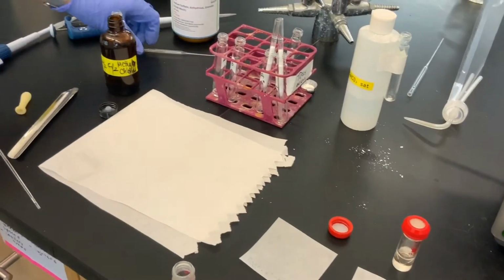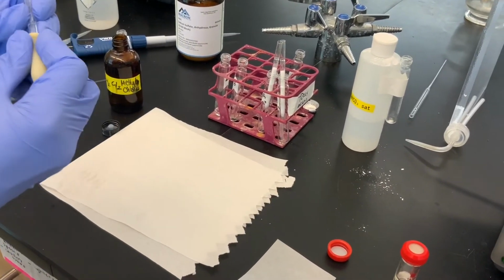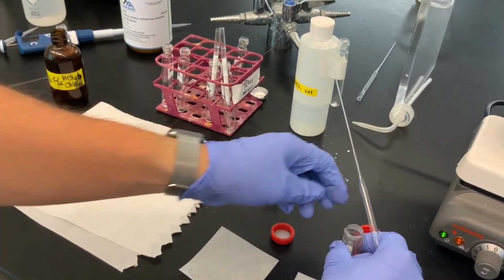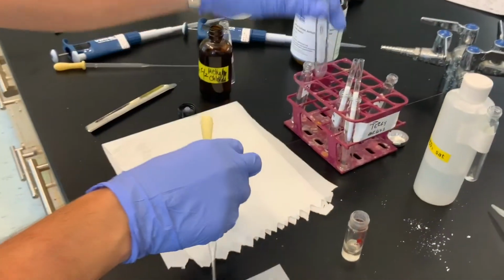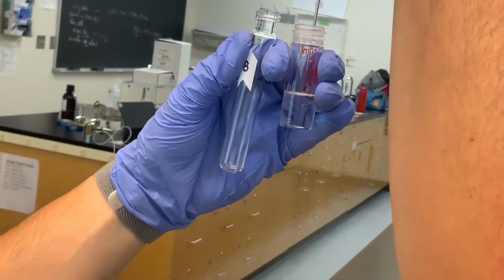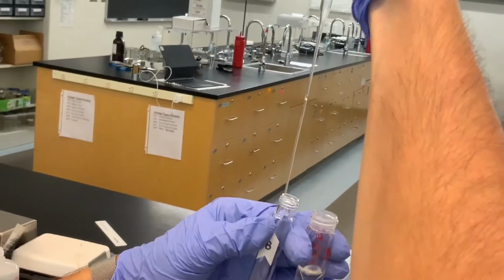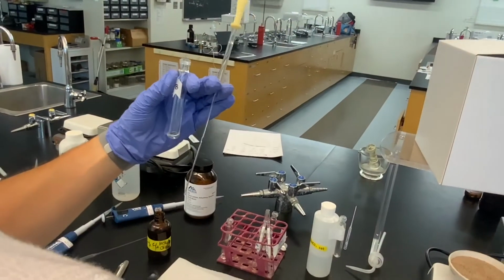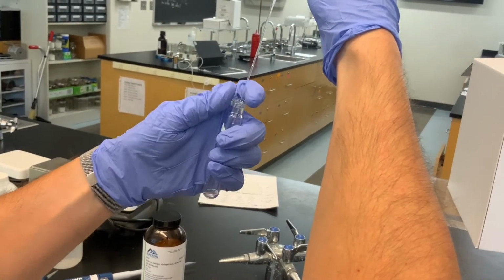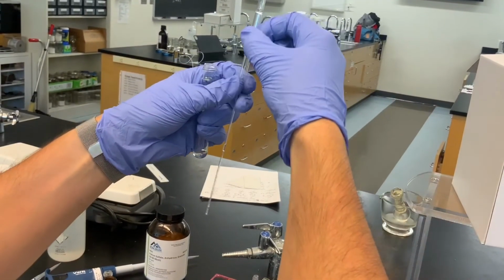We want to discard it, and now part B, we are also going to separate its organic layer and put it into culture tube B. And now with this one, we don't see that issue, of course, because we deprotonated the benzoic acid, so it shouldn't be in the methylene chloride layer, so we don't have a residue of it.